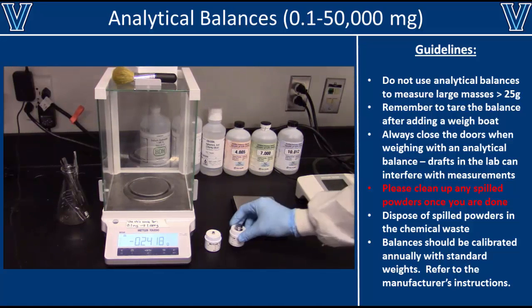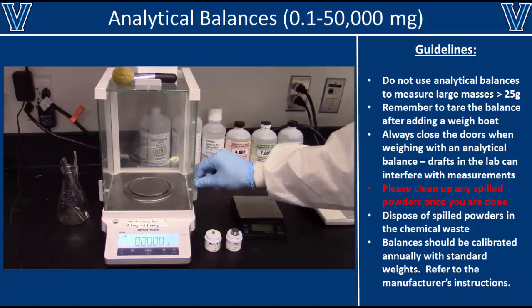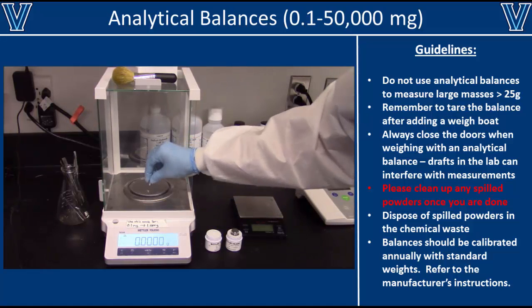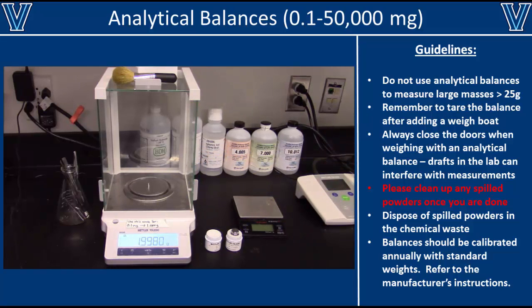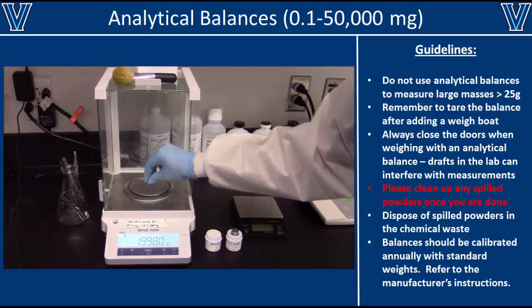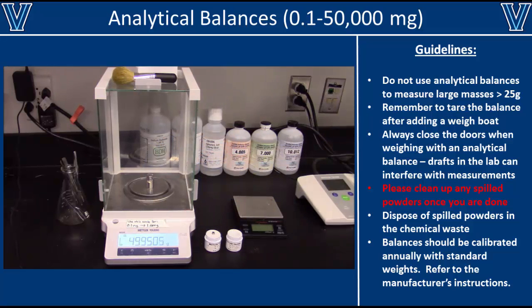Just like a pipetter, an analytical balance can also become inaccurate over time. To test the accuracy of an analytical balance, you'll need two standardized weights at the upper and lower bounds of the balance. In this case, we're using 2 and 50 gram weights. Notice that the 2 gram weight is reading 1.998 grams, which is less than 1% inaccurate, so that's pretty good. Next, we test the 50 gram weight, which weighs out to be 49.95 grams. This is also greater than 99.9% accurate, so the balance is working properly. If these readings were significantly off, we would need to calibrate the balance. Refer to the manufacturer's instructions on how to do so, or let your supervisor know immediately.